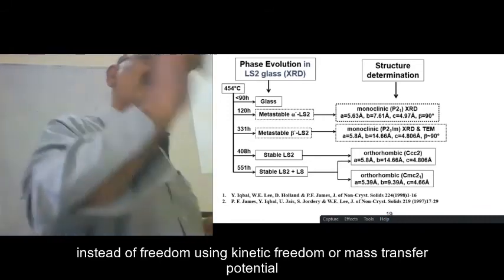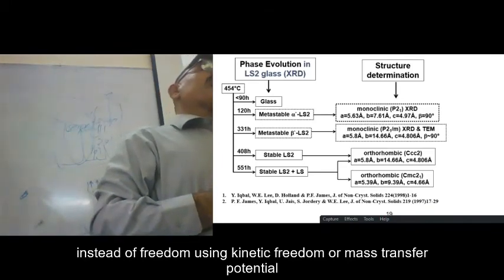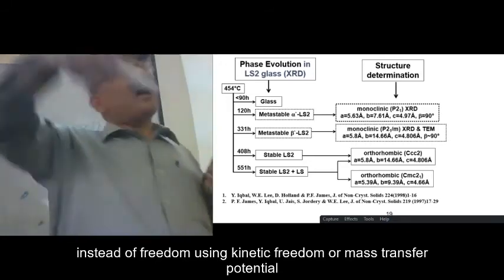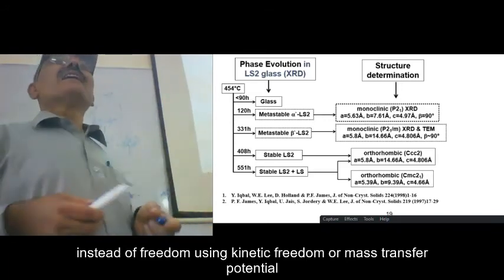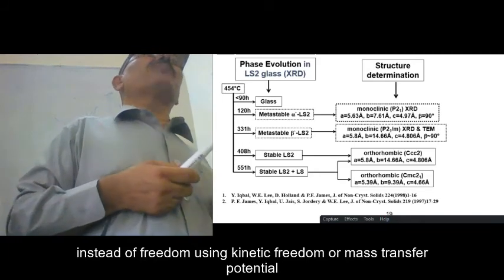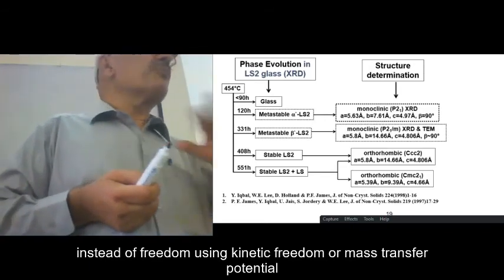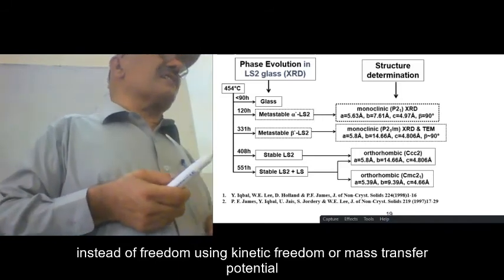So if your results are not consistent with the literature, this means something changed either in your experiment or in the experiment of that person, right? So I avoid putting a solid sample into the X-ray diffractometer. I prefer to finely grind it to make a fine powder and put it in the XRD.